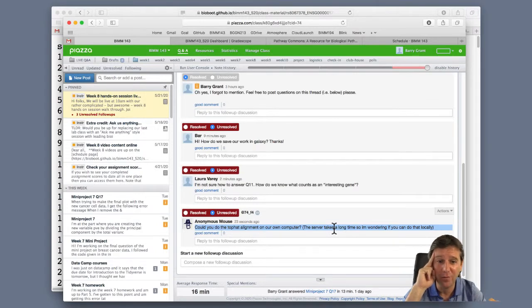We're running on the cloud for a reason, because it's got tons and tons of horsepower behind it. It's actually a big computer instance that we're running on. And you have to remember what we're doing. We've got hundreds and hundreds of thousands of reads, these little sequences, and we're mapping them to the whole human genome. And the human genome's pretty big, right? It's 3 billion base pairs. So think about the computations that you're doing. It may seem slow to you because it's not instantaneous, but we're not just aligning two sequences, right? We're aligning hundreds of thousands of sequences to 3 billion base pairs, right? It's a huge job we're doing.